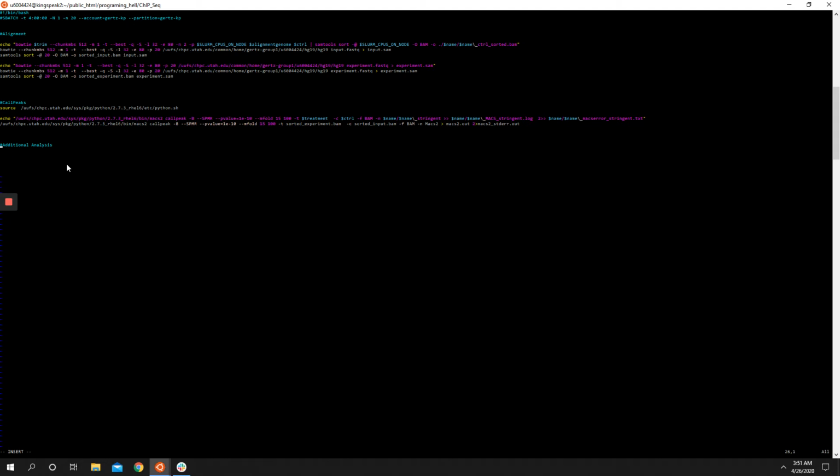Okay, so one of the things that we typically do is we like to grab motifs that are enriched in the peaks that are called by MACS, and part of this is just kind of self-checking to make sure that we actually are chipping for the motif we have. So if you know what it is, like CTCF or something like that, or ER, you can look for those motifs and confirm that you found what you thought you found. Otherwise, you may be trying to figure out what motif it actually binds to. This is also useful for that.